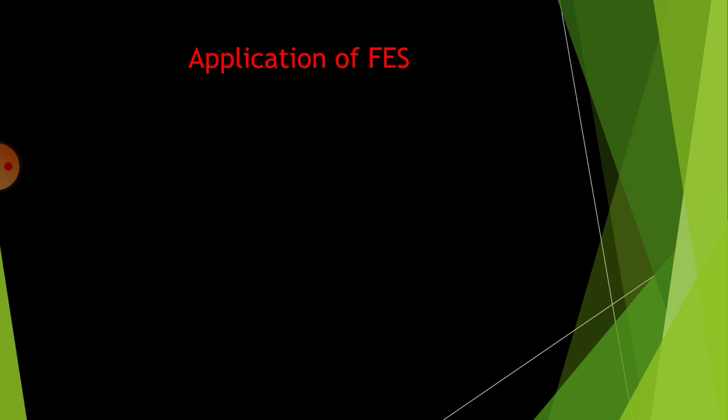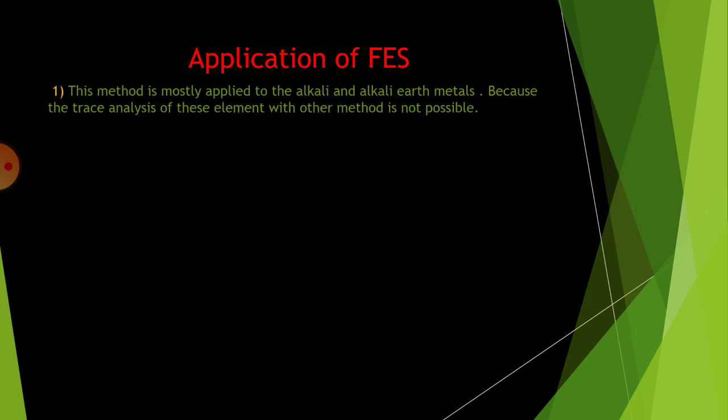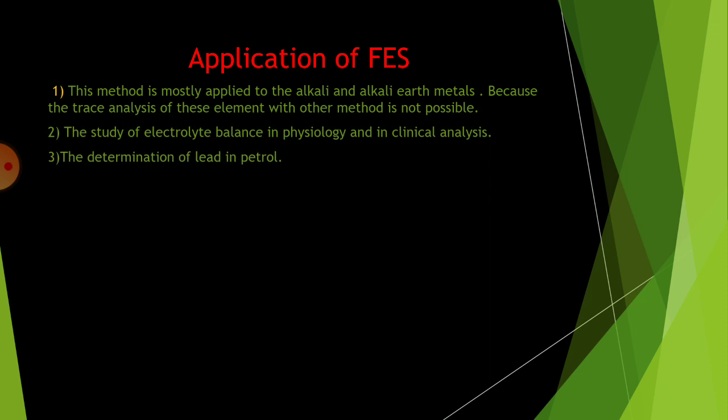So let us discuss the applications of FES. First application: this method is mostly applied to alkali and alkaline earth metals because the trace analysis of these elements with other methods is not possible or rather difficult. The study of electrolyte balance in physiology and clinical analysis can be done by using FES.